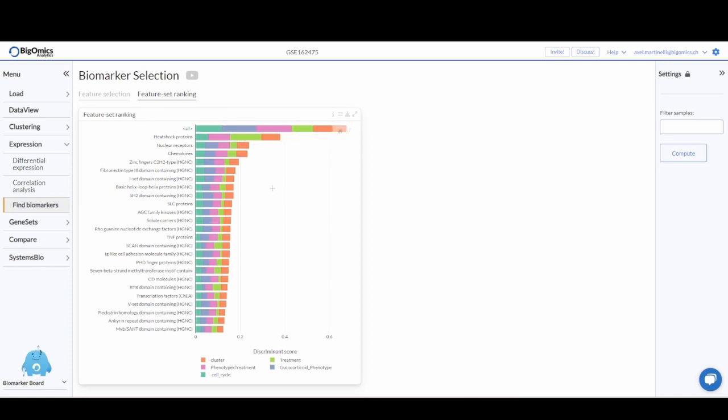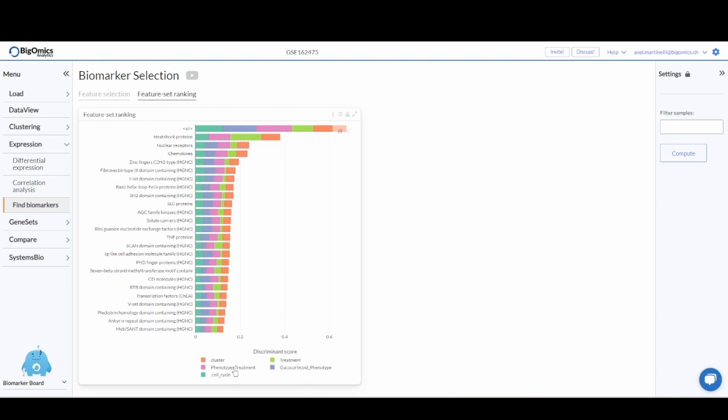This is mostly because heat shock proteins are pretty good at discriminating between treatment groups as well as the intersection between phenotype and treatment.